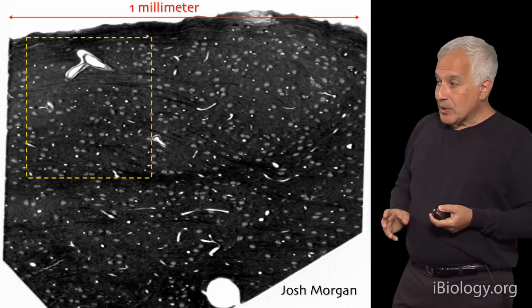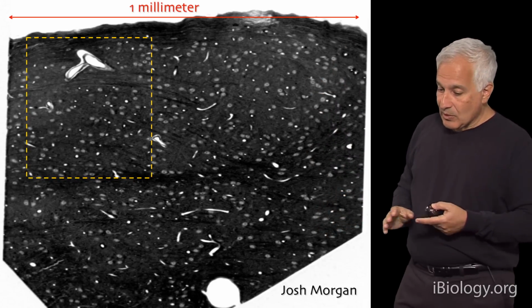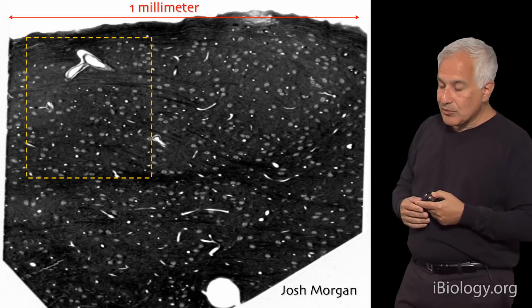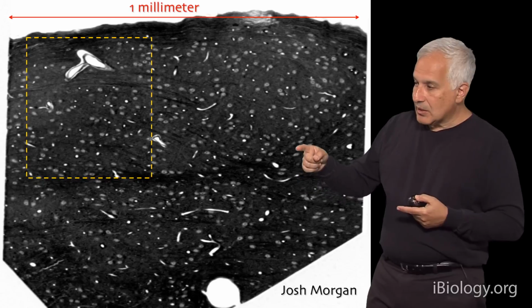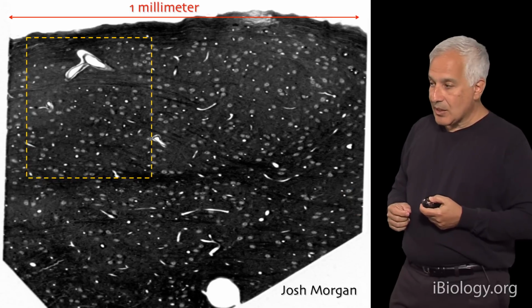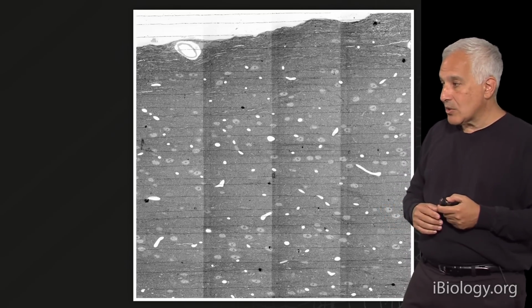To see that felt work, we image this, and this is about a millimeter by a millimeter image, at high resolution. In a light microscope, the best resolution you have, if you don't use super resolution techniques, is about 250 or so nanometers, a quarter of a micron. We're imaging this yellow box at 4 nanometer lateral resolution, and this section is 30 nanometers thick. So what does that section look like at 4 nanometers resolution?